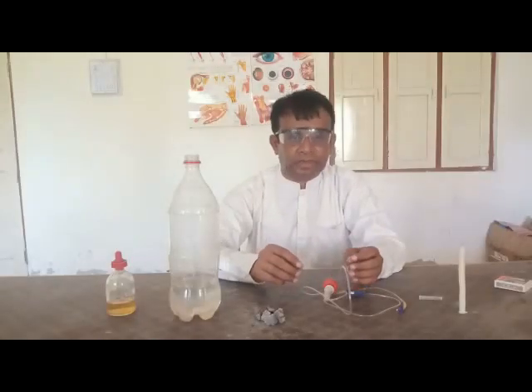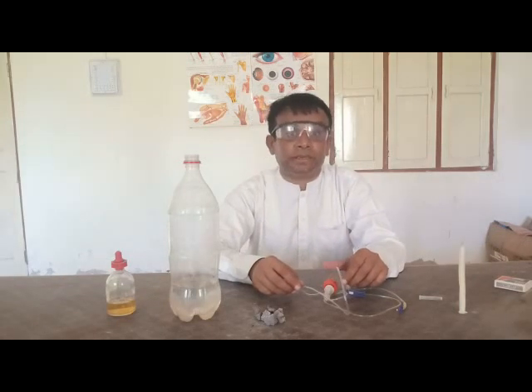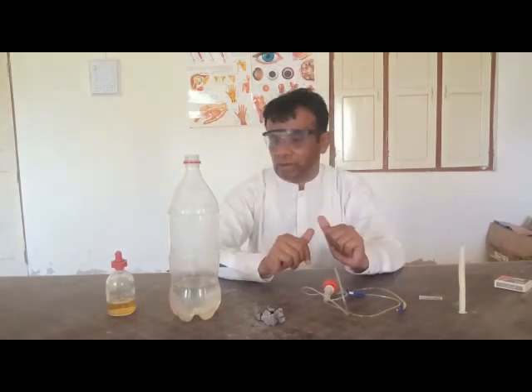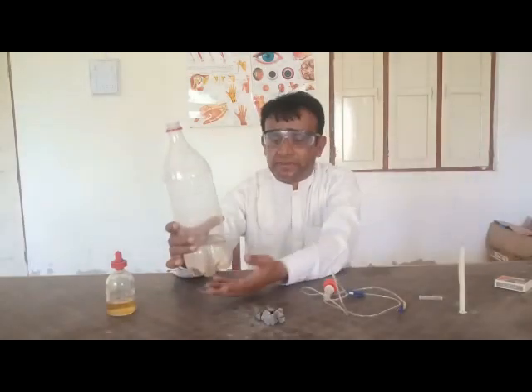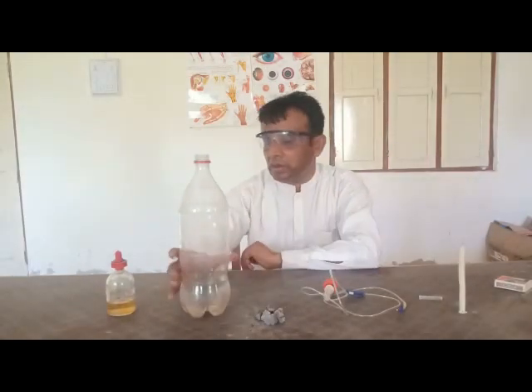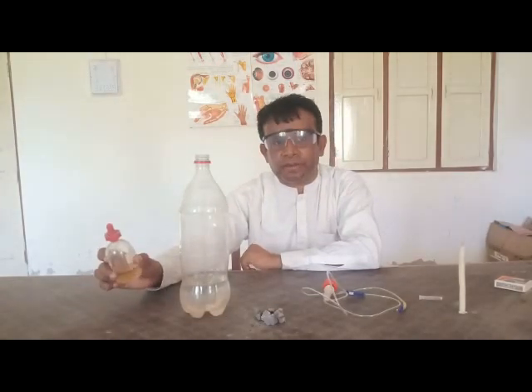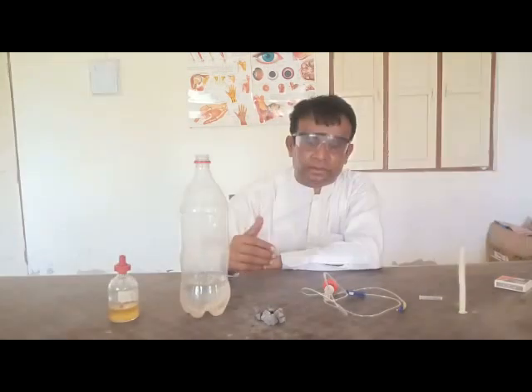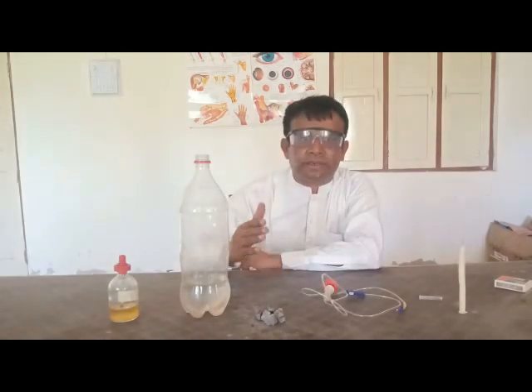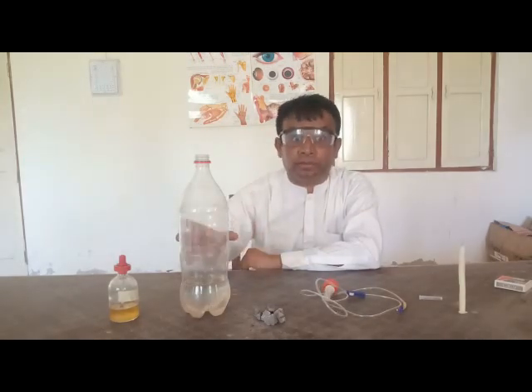We are in the laboratory and we will try to prepare the acetylene gas. The material that is required: there is a bottle, and in the bottle there is water, and also phenolphthalein. The main purpose of using phenolphthalein is that, during the chemical reaction, as we saw, acetylene and calcium hydroxide are produced.